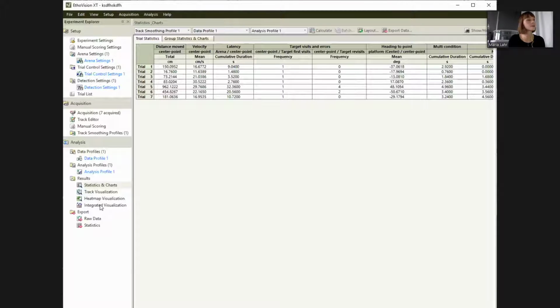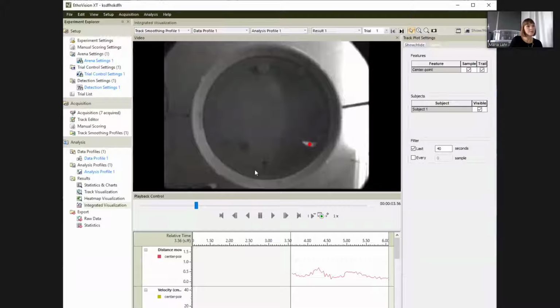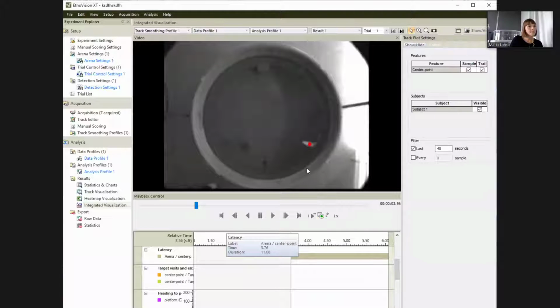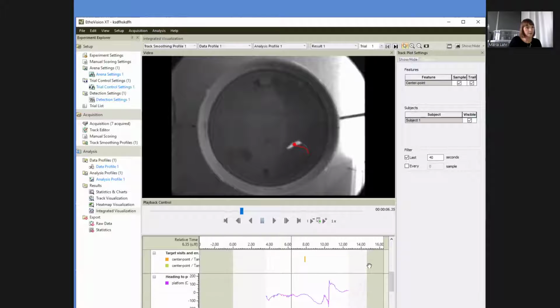And in the end, what I always do is that I check if actually what I have defined is correct. And this is the last step of things that I want to show you, that I see the mouse in the pool and I can make it go. Actually, wait, we make this a little bit bigger. So now we see the whole video.